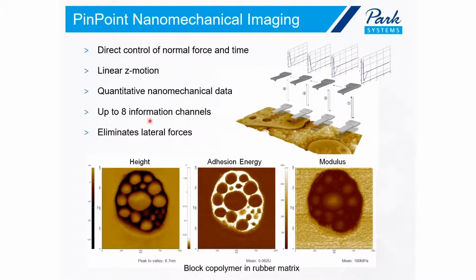You can choose up to 8 information channels, so this allows you customizability. Other systems don't offer it as a separate mode. For conductive pinpoint, you have to buy it separately. It's one package. There's extra hardware for conductive pinpoint, which I will show you shortly. But there are no locks and bounds in the software.